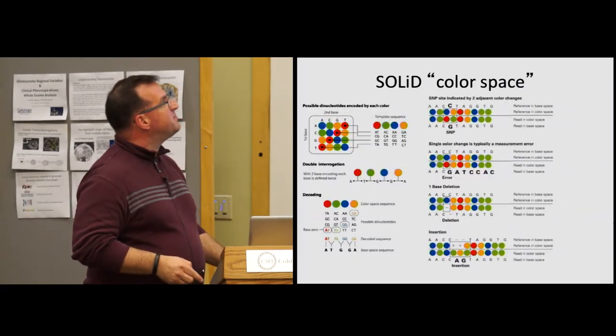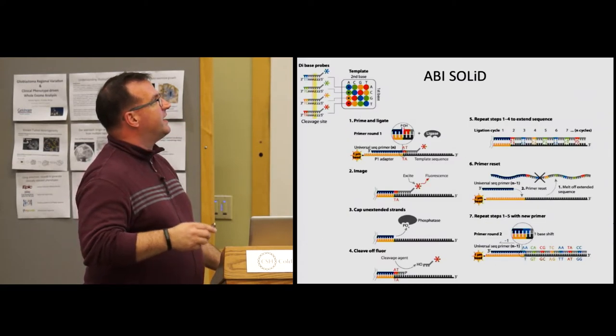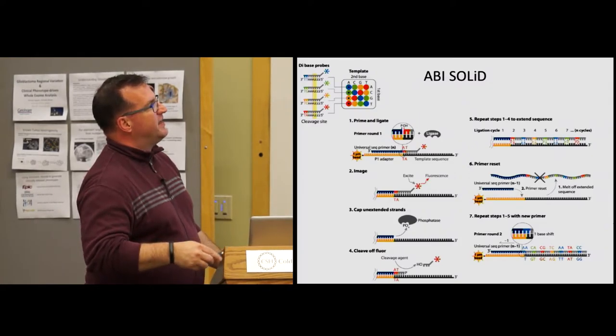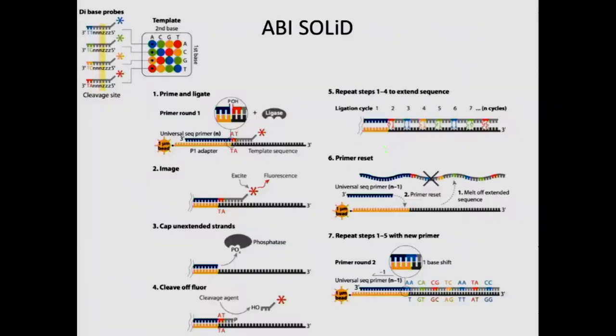It knows the first base because of the ligation in the first place, this adapter sequence. So that's why it shifted backwards. Essentially it shifts backwards so it sequences a little bit of the adapter, in which you know what the sequence is. You know what the adapter sequence is going in. Yeah, good question though. Because instead of being n minus one, it could have been n plus one. It could have worked if it had just shifted off to the right.